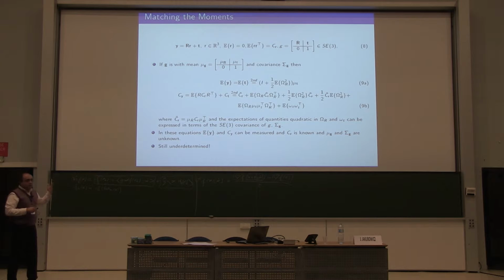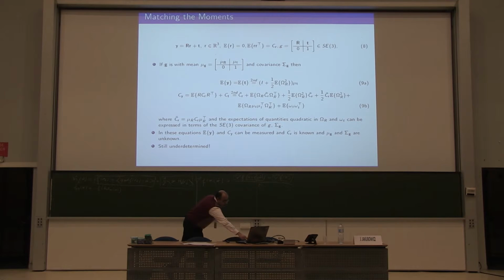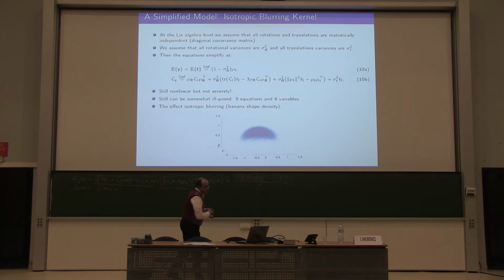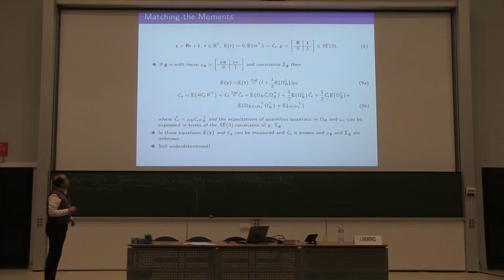Okay, so those who have worked in, for example, blind source separation are familiar with this matching of moments from the observation to the known variables. So the next step is that we will have a... okay, so another point here is that, because if you do this counting of variables, you will see that the number of observations, this side is you observe these variables, still this is an underdetermined problem.